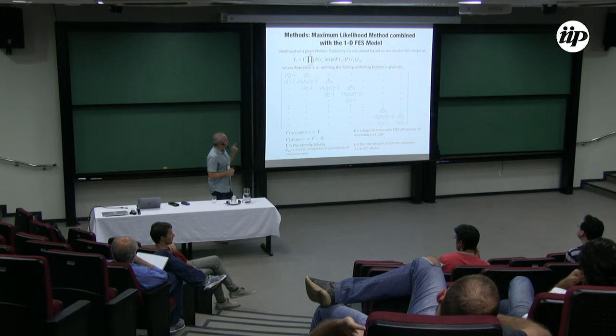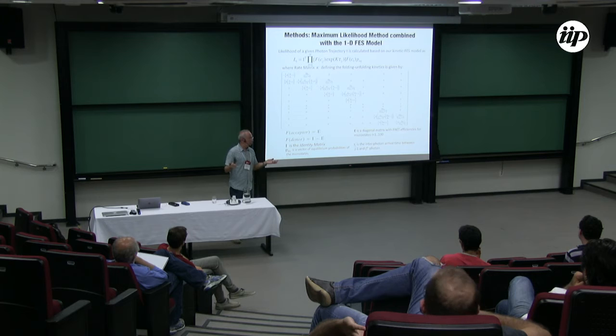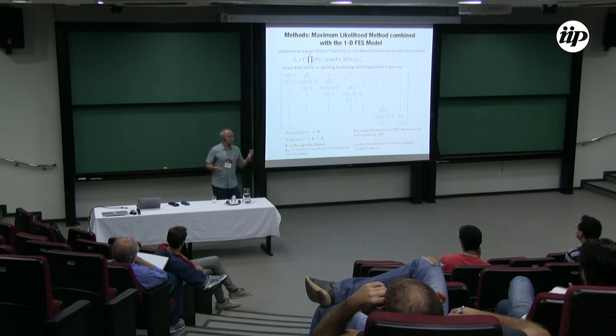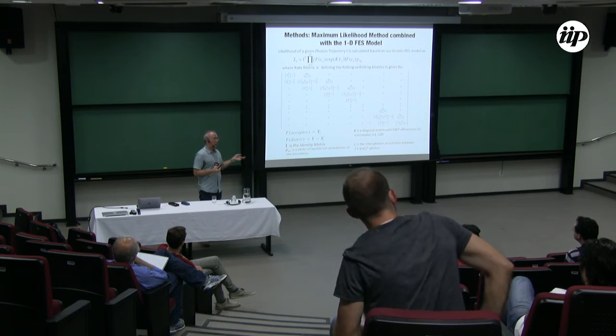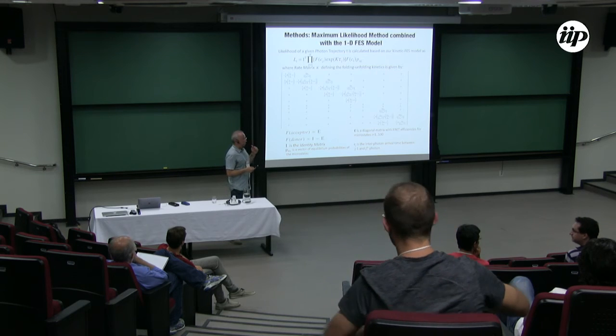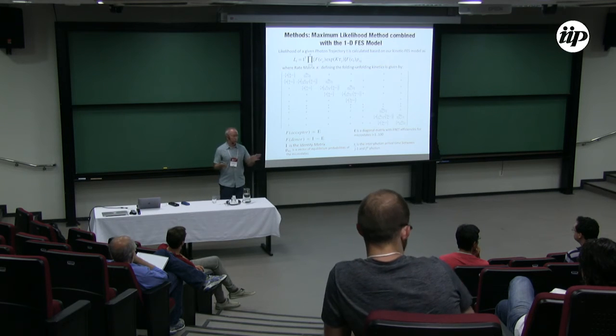Yeah, because also, you don't get this until much later on in the process, right? So you're not seeing things on the spot, right? So you're getting these photon trajectories. It's very hard to make sense out of them by eye. So it's not until you do the whole analysis with lots of them that you actually get information out of this. So it would be very hard to know where you are in real time. So it still has lots of limitations. The big advantage, as I say, compared to what people are doing nowadays is that you don't have to bin. Because when you bin photons, then it becomes a mess.